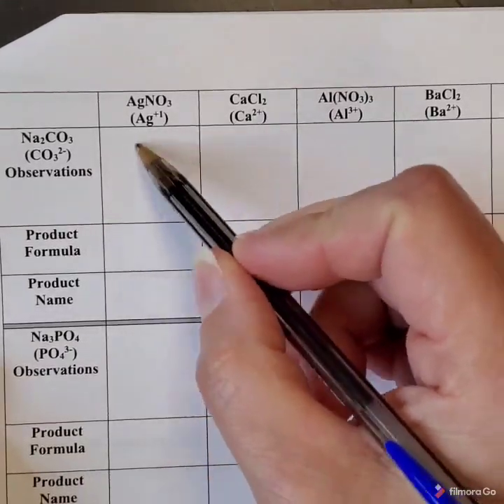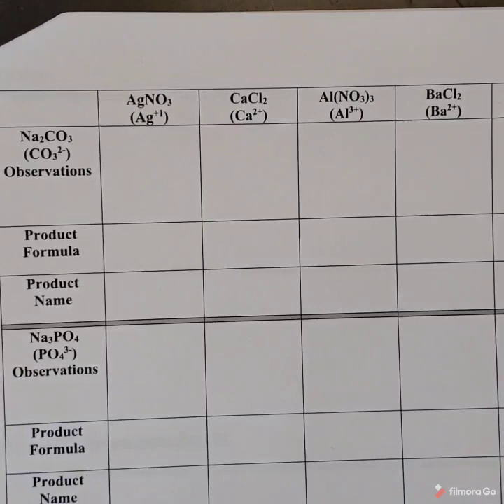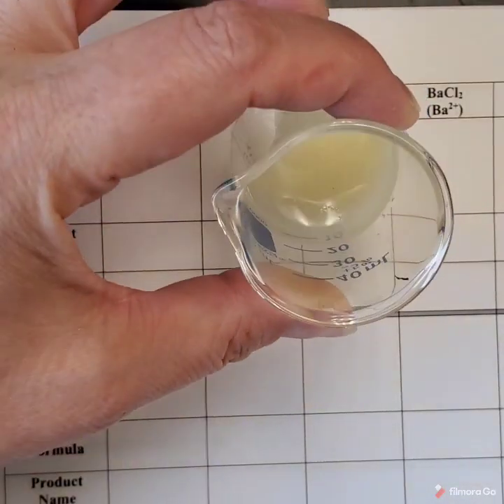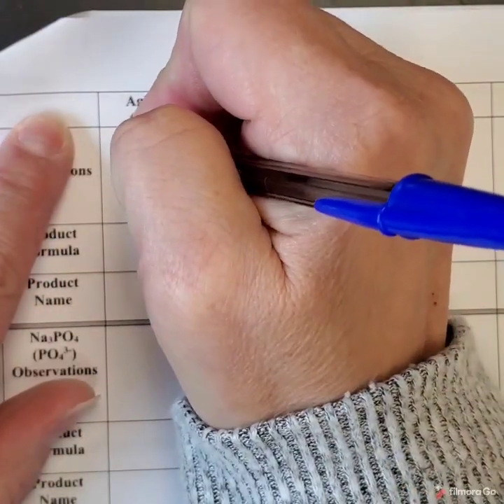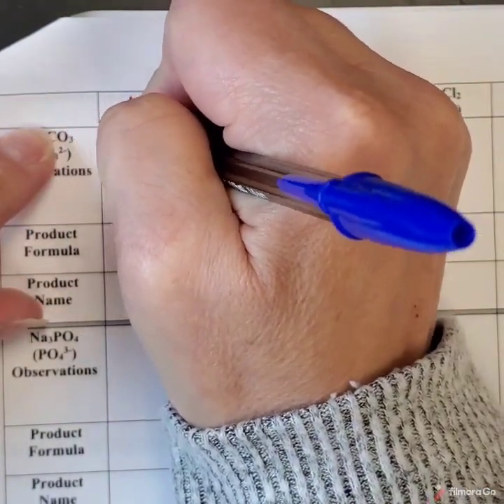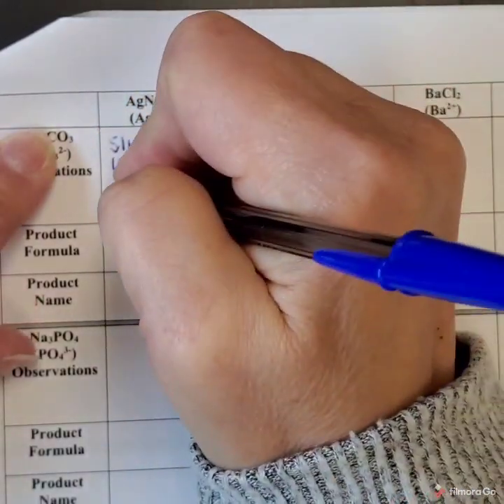In this square here, you're going to write the observations for the silver nitrate and the sodium carbonate. It's the first one in that upper corner of the grid. So this is what it was. I would say it's slightly yellow, and it's powdery.